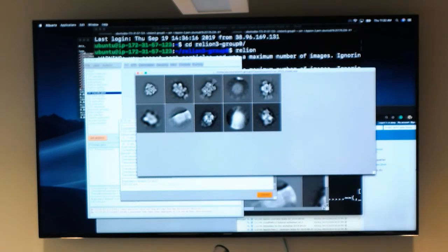Again, the issue is not necessarily object selection, it's particle verification. And especially if you're working with a complex, it can get tricky because you're trying to verify the core would be the same, but you have a judgment saying like, okay, this has 5 components, that's a particle, this has 4 components, that's not useful for me at all. And that can be quite tricky to really tease out. And that's why you would have to move on to, let's say, 3D.